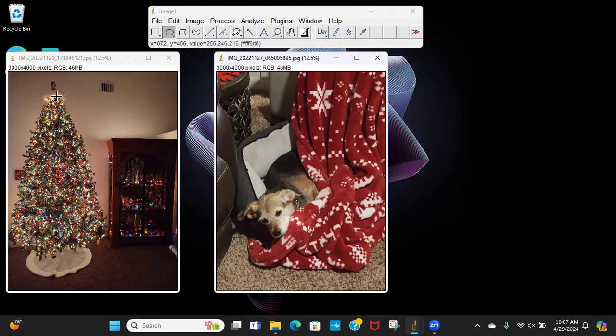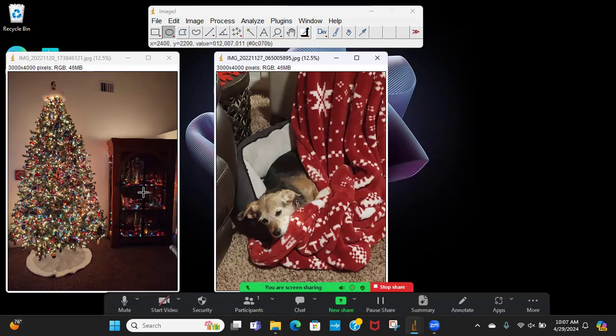So it's almost saturation at 255. You can see all those values are close to 255. Now hovering over the dark section here of the handles, we can see that those three values are close to 0 in the dialog box, or black.